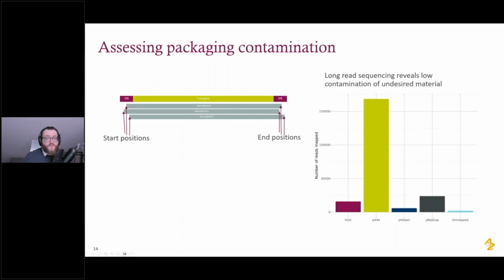However, in real life, we can see things like shortening of the ITR regions. We can see truncation hotspots. In some cases, the transgene is truncated at a specific hotspot, and this is an obviously very detrimental QC issue and a problem for the therapy vector.